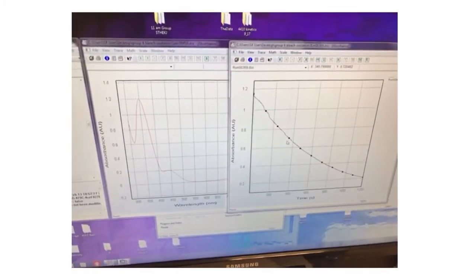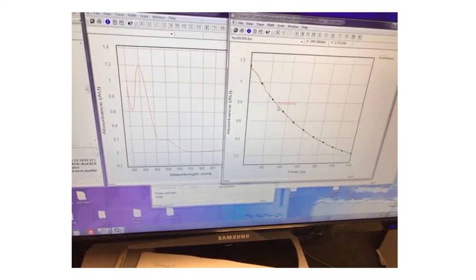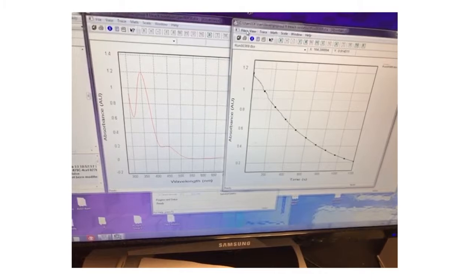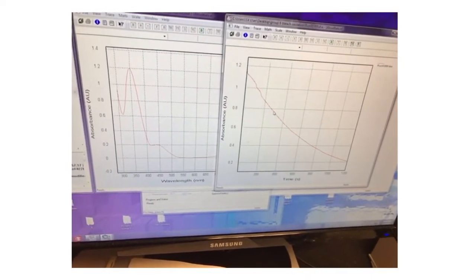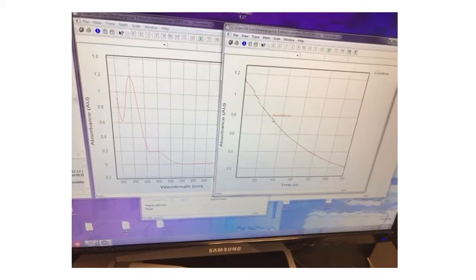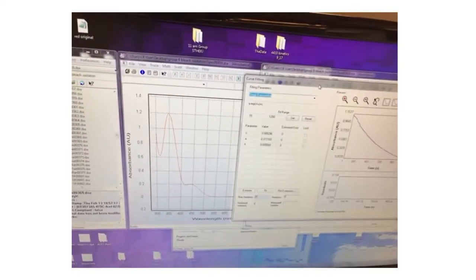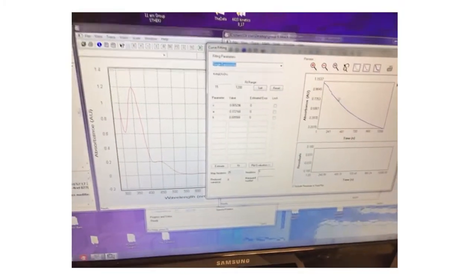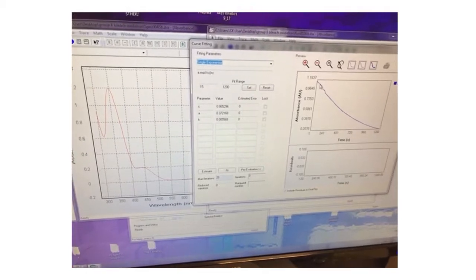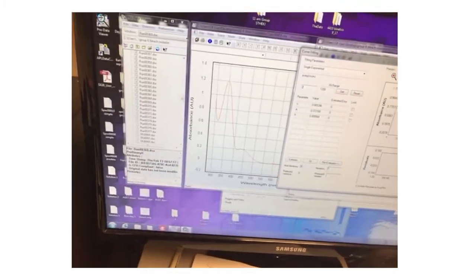One of them is to actually just run, I guess this is long enough to do a fit here. So what you want to do is select the data, just click on it with the mouse. I had it clicked on before. So then do math, and then choose fitting. So in the fitting menu, you can choose to fit it, say, with an exponential. I see a little bit of noise here going on, so I might choose to start this after 250 seconds.